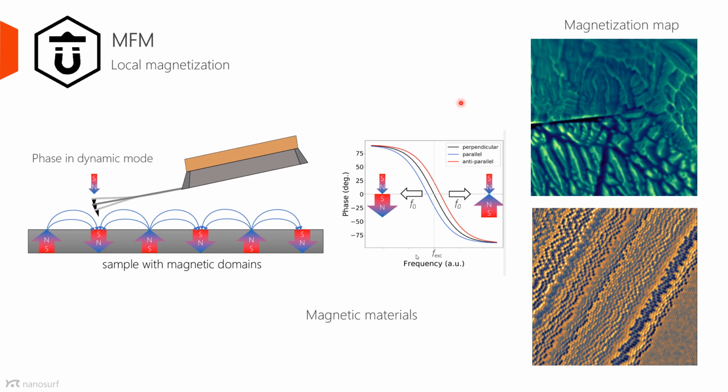Typical samples for MFM, for instance, electrical steel here, where you can see three grains, where the steel is oriented in different directions, and now the boundary between the grains is marked. And you can see the magnetic textures are different between the different grains. For instance, a hard disk drive here, where you can see the bit encoded information in the sample. And also nanostructured devices or materials.